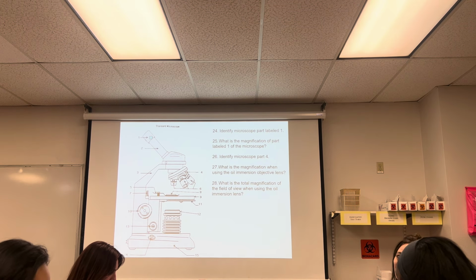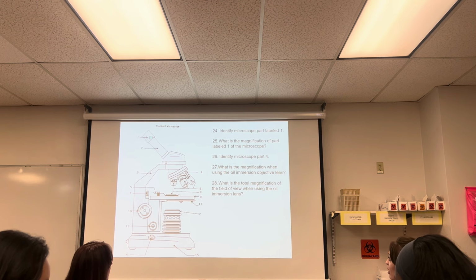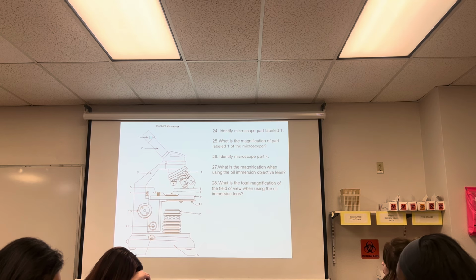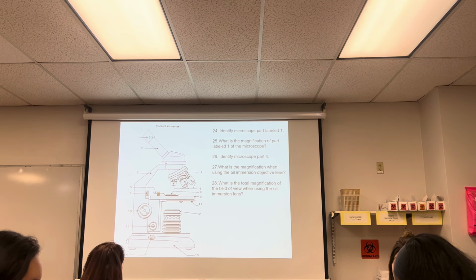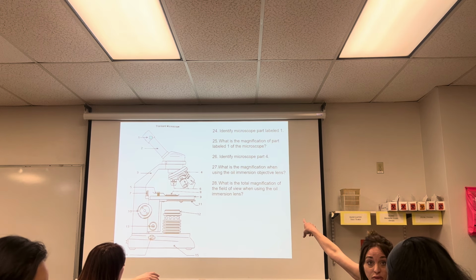What was 26 again? You like the 10. Oh, that's the nose piece. And 27 is the lens. And 28 is 1,000. No, 27 is... So I will never ask, well, I shouldn't say that. Okay, so those are the ones that I like to ask most about.